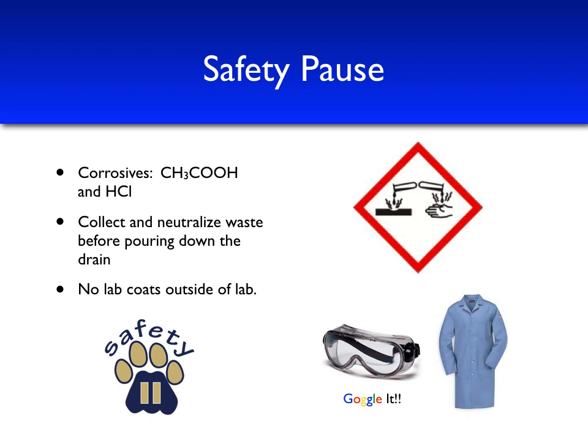Another reminder that might not have been mentioned before is that when we wear our lab coat and goggles in lab, we do need to make sure we remove these pieces of PPE, particularly the lab coat and any gloves, before leaving the laboratory, so that we do not contaminate other areas with chemicals.